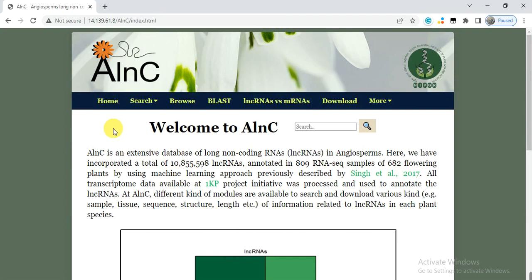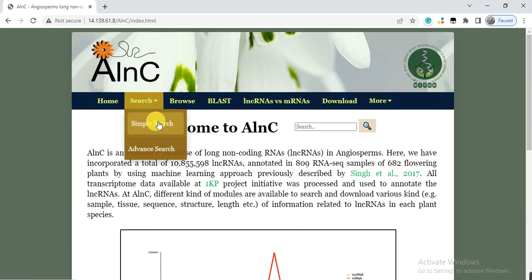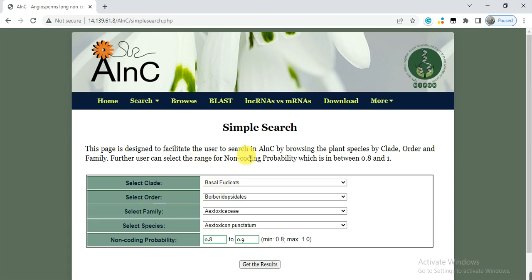First we will see how we can find or search for long non-coding RNAs in our species. Go to the search and click on simple search. Remember that to find long non-coding RNAs in your species from this database, you must know the clade of your species — which clade and order your species belongs to, and its family. If you don't know this, it will be difficult to find the long non-coding RNAs from this database.